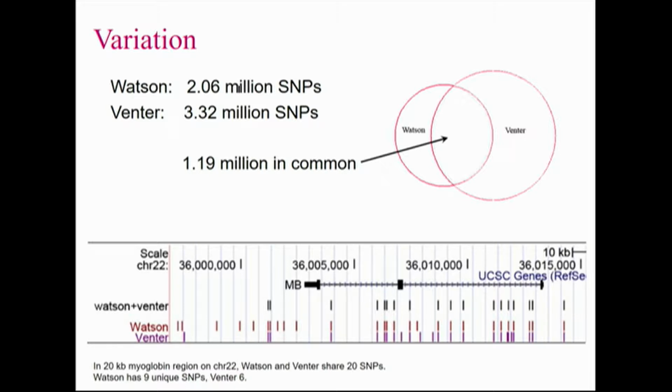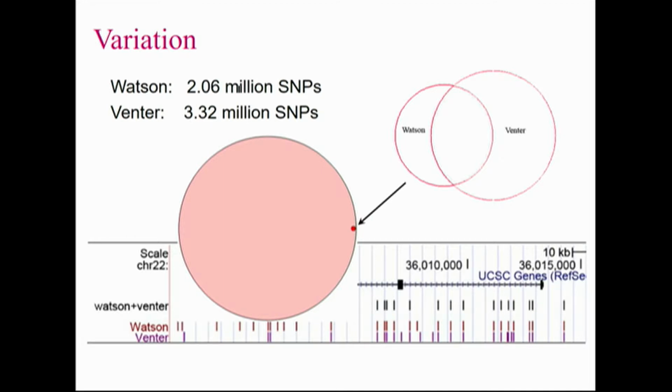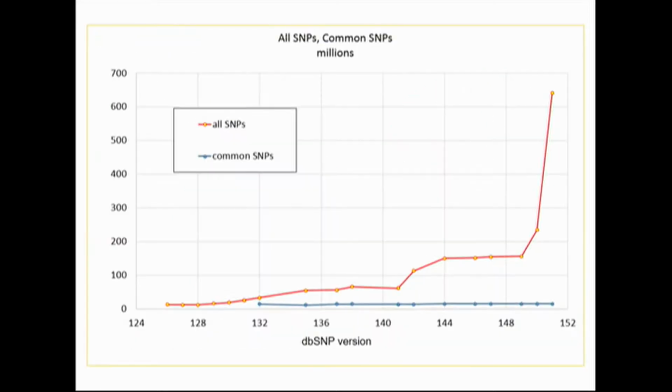And so now you have data sets on the browser that you can look at in detail, each one of those variants. And so what the browser does is let you load all of them in together. Here's that 1 part per thousand, because it's roughly 3 million variants out of 3 billion. So basically you're throwing away most of your data when you get it down to the remaining variants, but you still have a couple million or 3 million things to dig through.